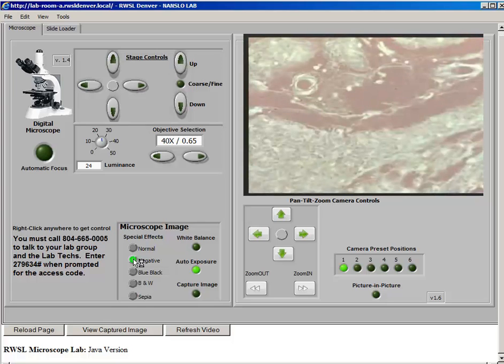In the negative mode, the sample is displayed in a color-inverted form, where red, green, and blue values are converted into their complementary colors. The technique is useful in situations when color inversion can be of benefit in exposing subtle details or in quantitative analysis of samples.